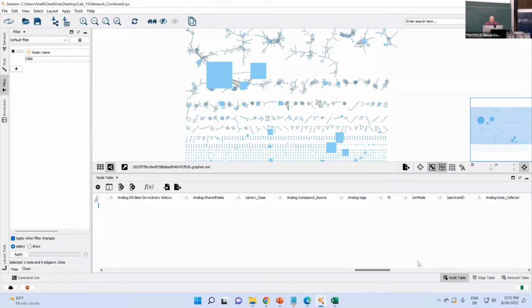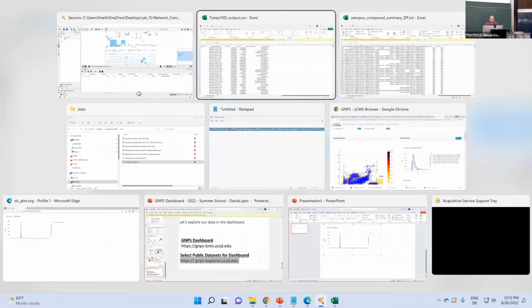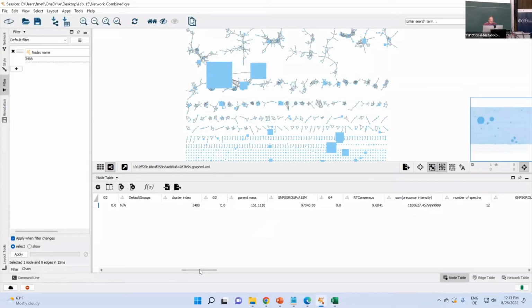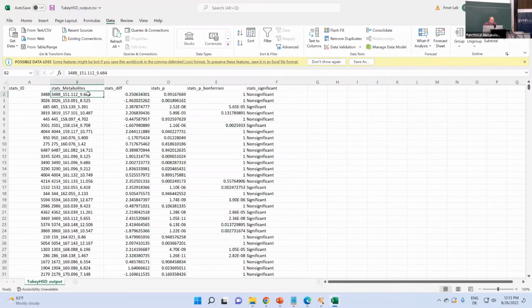Let's actually see what... 1118. Oh, 1112. What is that? But the retention time, 968. Maybe it did some weird rounding here.